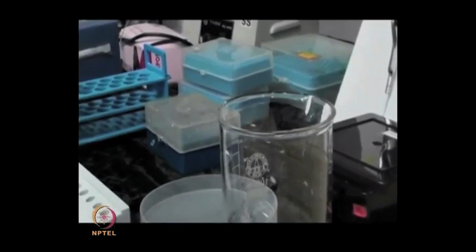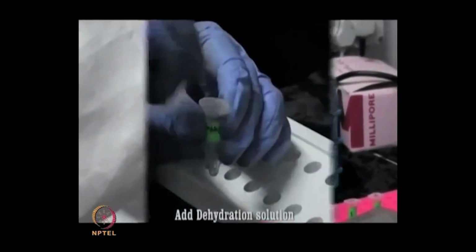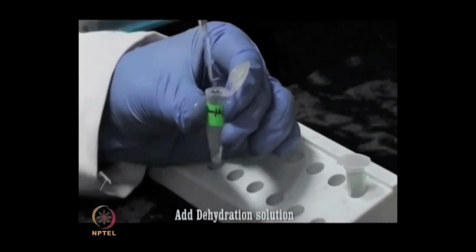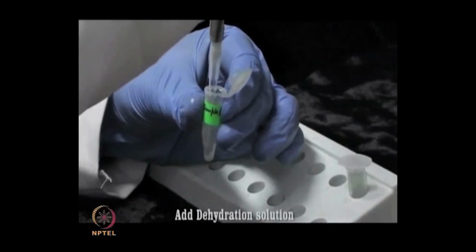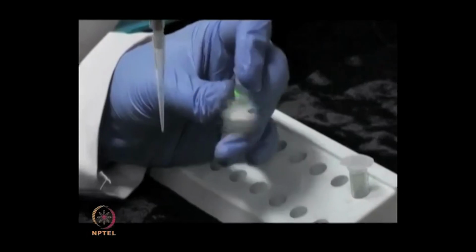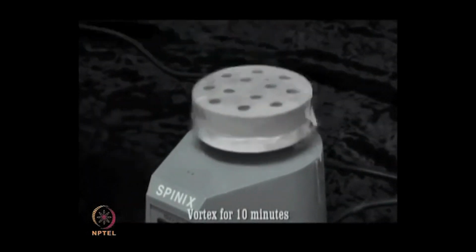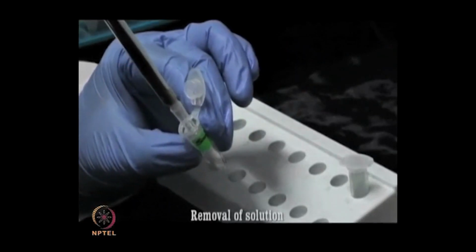Now, chill down the tubes to room temperature, add 50 microliters of dehydration solution, mix it properly and incubate for 10 minutes. Now, remove all the liquids.